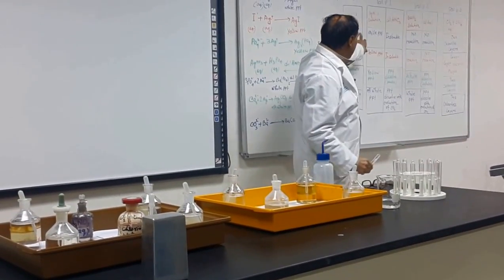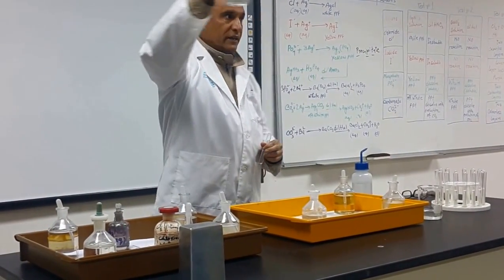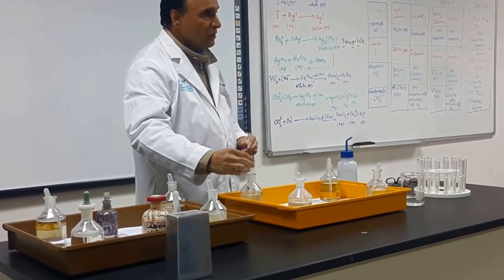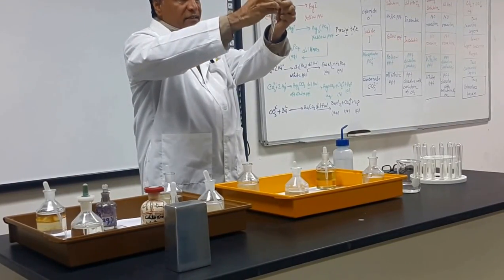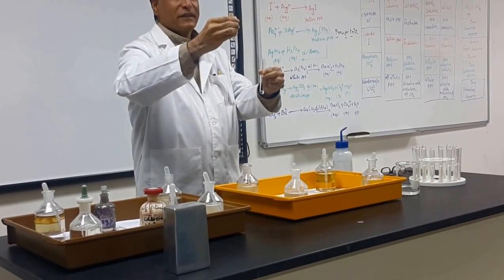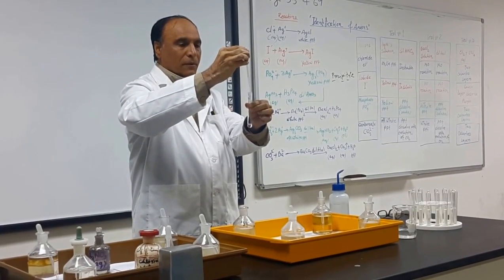I take chloride. I read the label. Here is the chloride, it is written over there. Chloride. Right? I take this one, look over here, and I put into that. I am not inserting inside. Inserting inside will contaminate it. All the solution becomes contaminated. So from the top, do it.